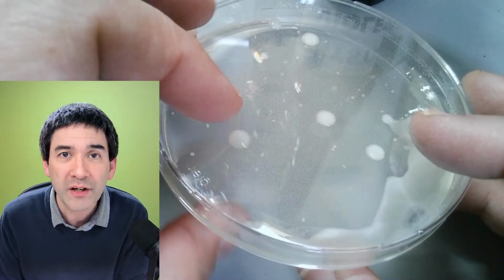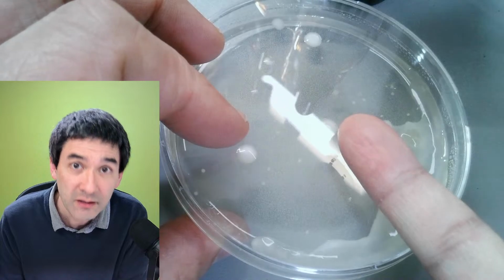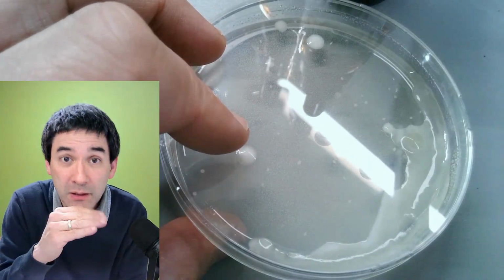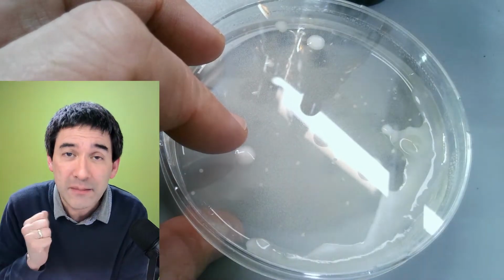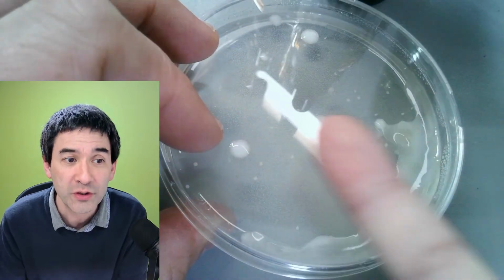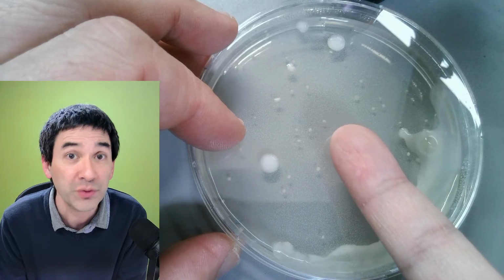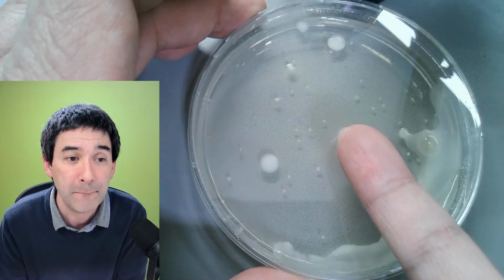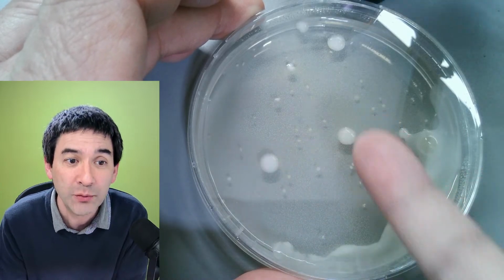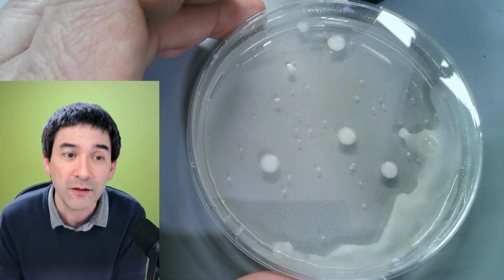But this bacterium will start to divide from 1, 2, 4, doubling 8, doubling 16, 32. At the beginning, not a lot happens, but it's exponential growth. This basically means that after a couple of hours, you have billions of bacteria in one colony. So each one of these dots that you see here contains billions of bacteria, but comes from one original bacterium, right? So by counting those colonies, you can actually determine how many bacteria were present in the first place.